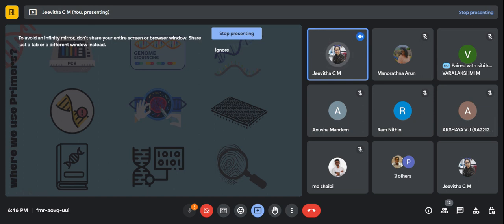So everywhere we need primers, because some primers will be universal. When you're doing some forensic kind of study, some primers will be universal. It will be the same region, the same set of sequences, present everywhere, and we call them universal primers. So we can just put in those universal primers and identify what species or what organism it is. So we use primers there.